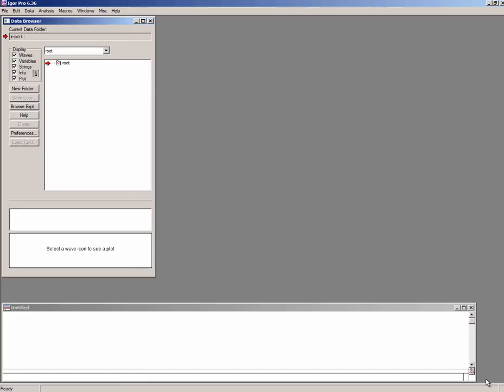In this case I was provided with a data set that is kind of good enough to give us an opportunity to do an analysis based on purely small angle scattering principles, which may or may not be the right analysis for this specific set of samples. But it's actually good enough, data are good enough to guide us through some kind of reasonable analysis.